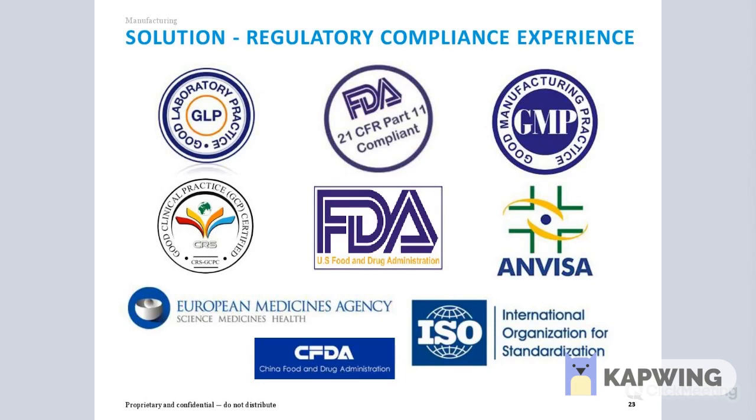It's also worth mentioning that LIMS should aid in your compliance with all major ISO standards applicable to your quality processes in the laboratory. A robust and sophisticated LIMS provides the tools, structure, and workflow support for quality processes with minimal user intervention and maximum effect.